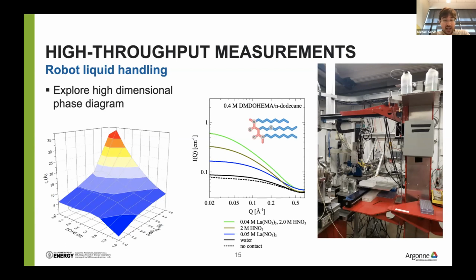And so we're still not automated in when we prepare the samples, in the sense that we don't have any kind of similar analogous robot to help us prepare the sample. So we're still being the robot ourselves in the lab when we make these, but at least when we go to the APS, where we're under the time crunch of the beam time, we can collect lots of data with this high throughput methodology. So I think there are some interesting opportunities here for further high throughput machine learning analysis of this data.